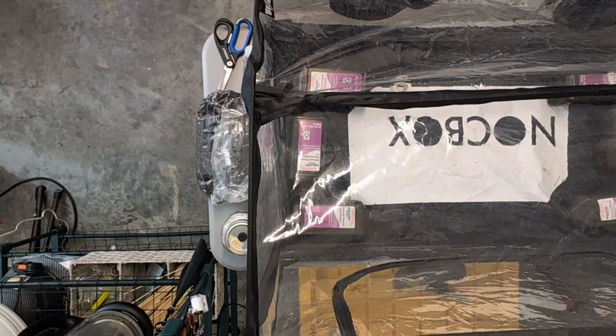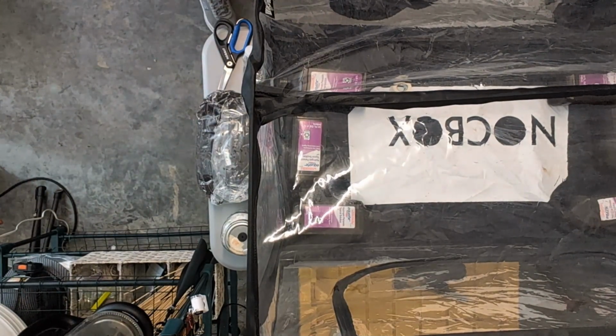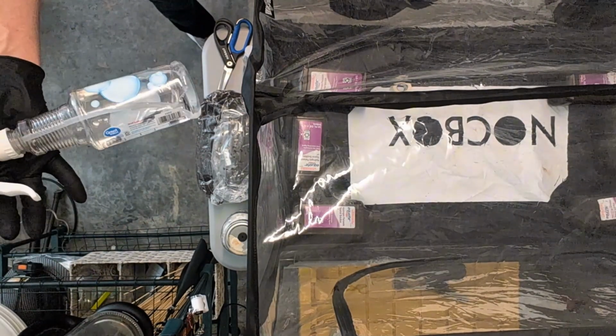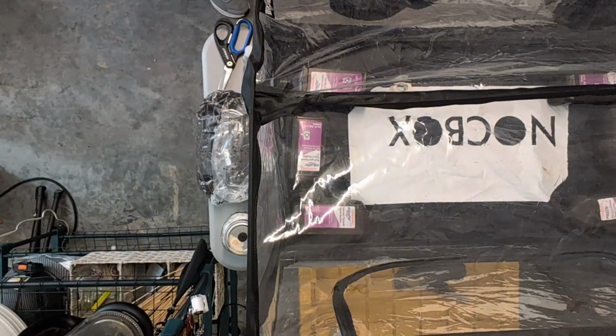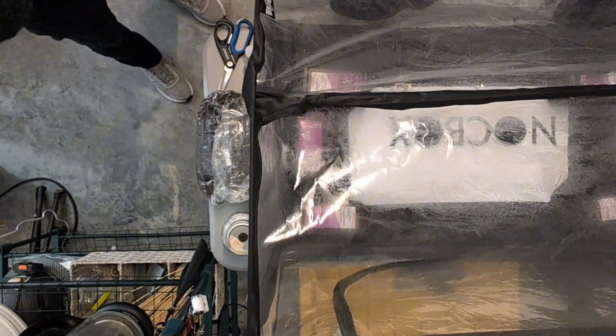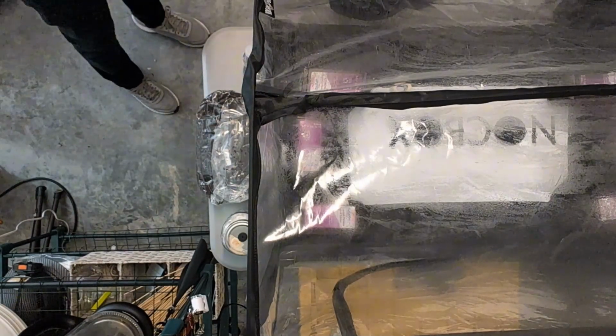So, what am I going to use to sanitize this stuff before I put it inside the still air box? I have a bottle here of 70% isopropanol, and I'm going to saturate a paper towel in the alcohol, really, really saturate it. Once I've done that, I can use it to wash my gloves real quick. And I want to put things in the still air box as I sanitize them.